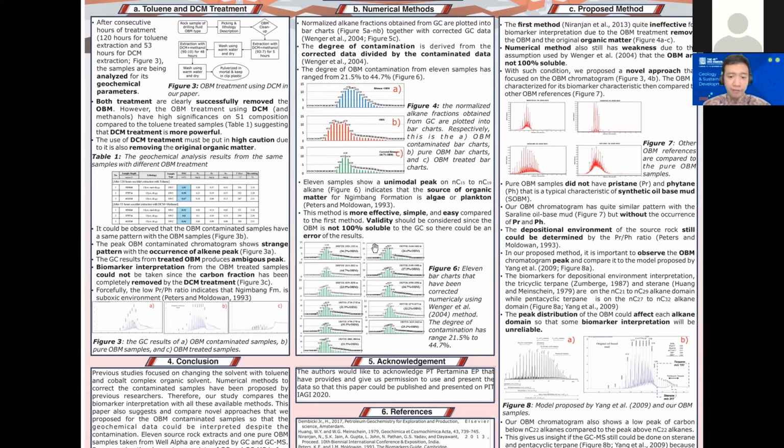This method is more effective, simple, and easy compared to the first method, but validity should be considered since the assumption used by Wenger et al. is not 100% true. The OBM is not 100% soluble to the GC, so there could be a little error in the results.